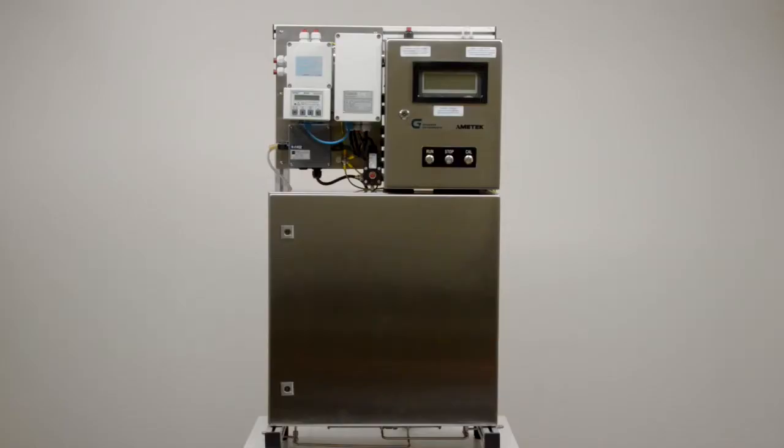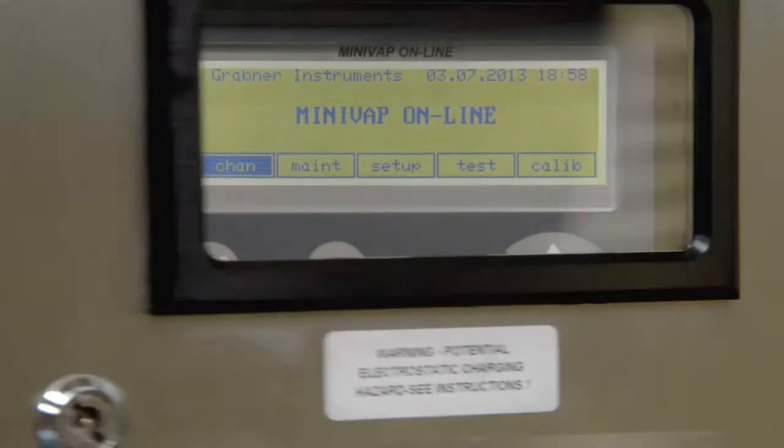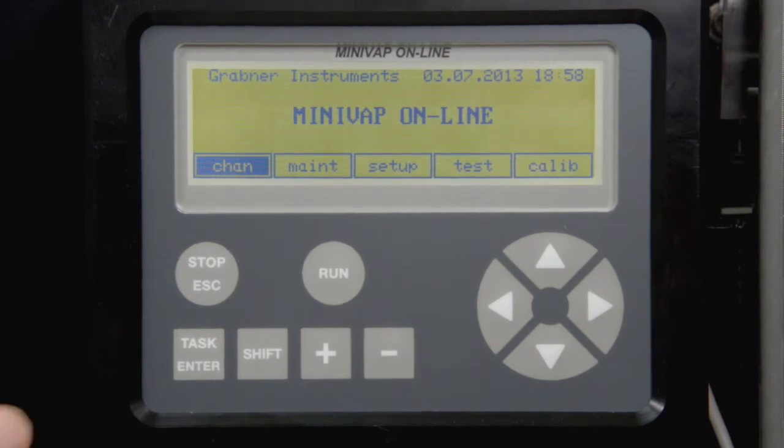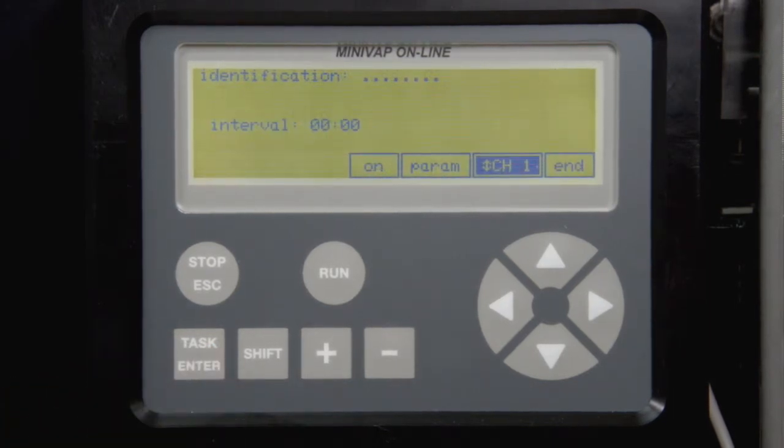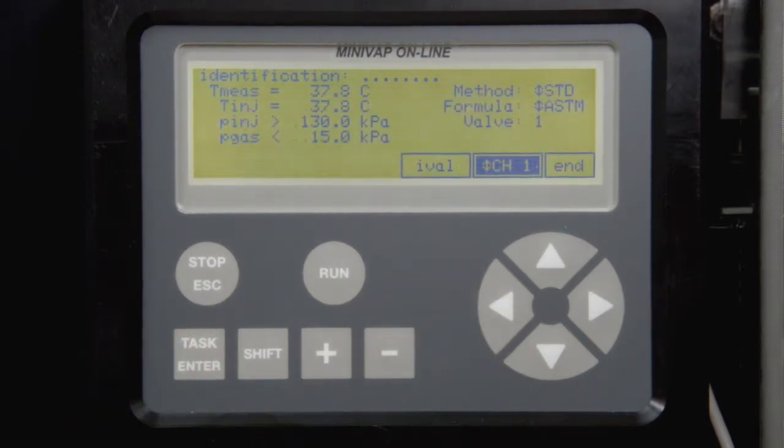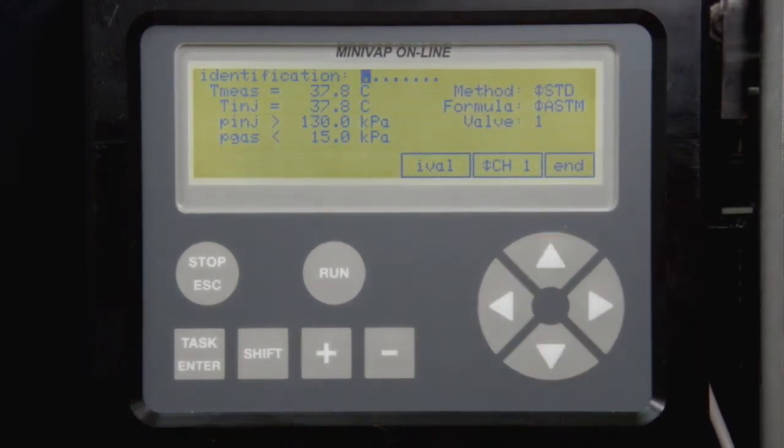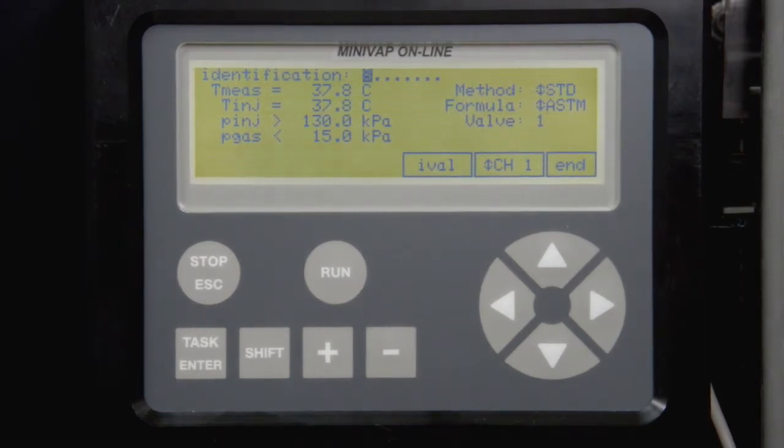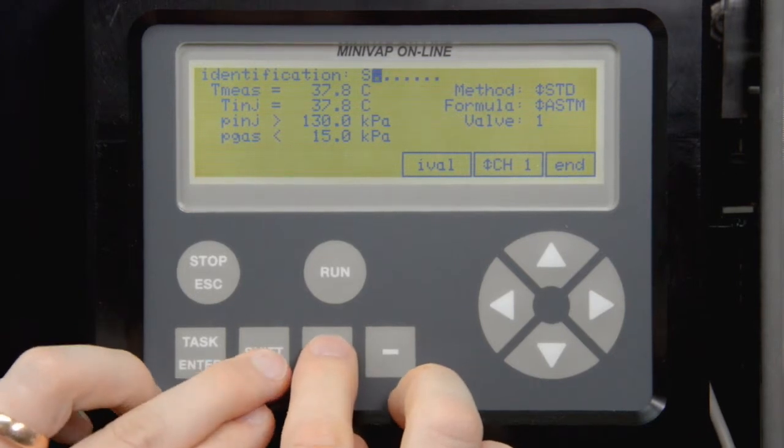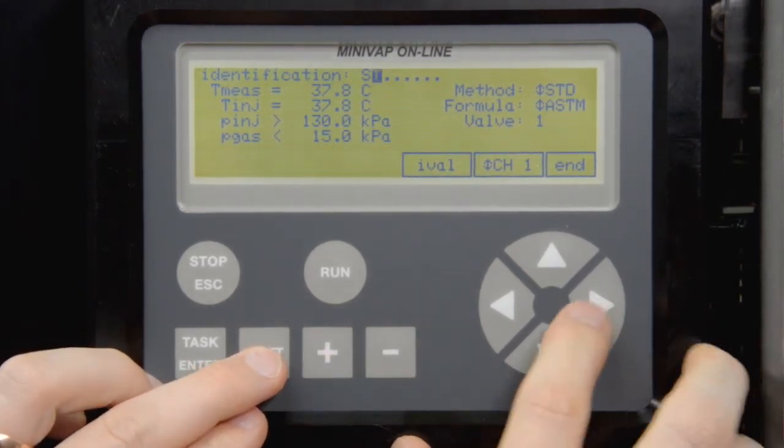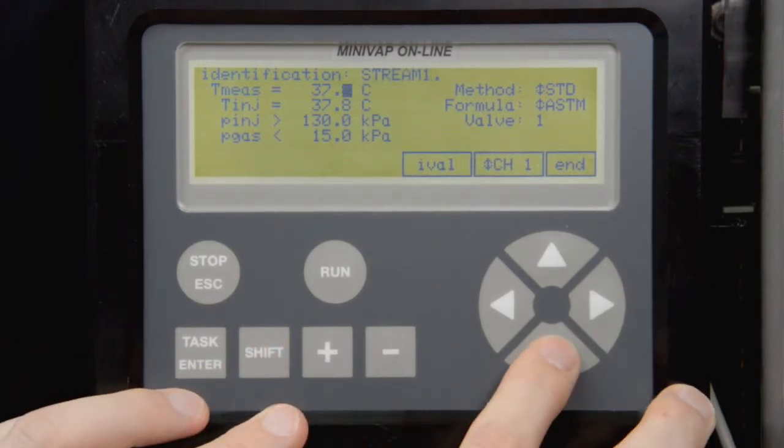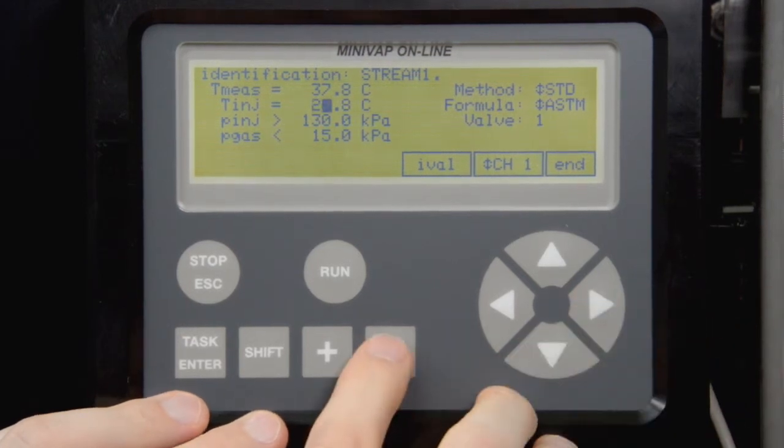Programming. Six measuring channels and one calibration channel can be programmed. Each channel can be programmed individually so that different methods can be programmed to run on the same sample stream. To program the measuring channels, put the cursor on Chan and press Task. Go to Parameters and press Task. Place the cursor to Channel 1 and select a measuring channel. Enter the channel identification. Use the plus-minus keys to scroll through the characters or use Shift and plus-minus keys for fast scrolling. Select measuring and injection temperature, the minimum injection pressure and the maximum gas correction.